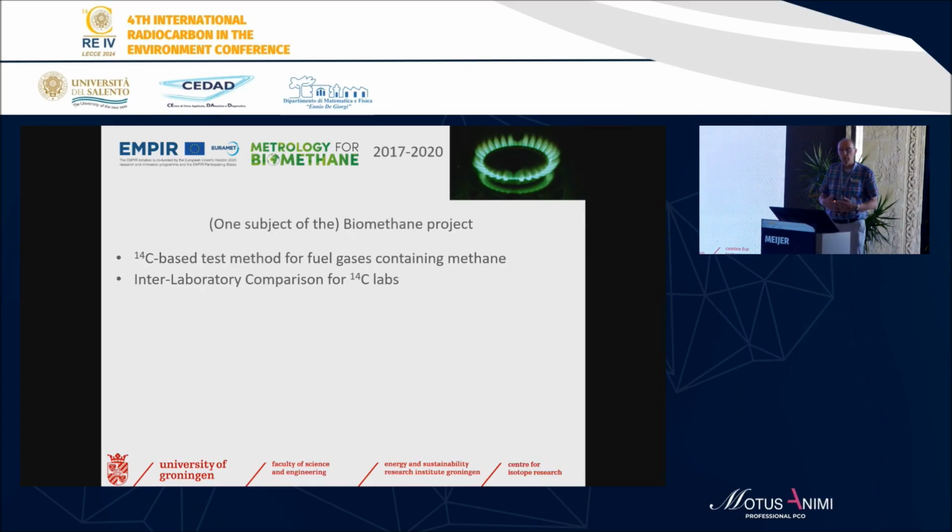The rest was about trace elements inside the biogas that could possibly disturb the burning process or anything else. That was not of our concern. We had the part that had to do with 14C. So our task was to develop a 14C-based test method for fuel gases that contain methane. And for that, we organized an inter-laboratory comparison for C14 labs.